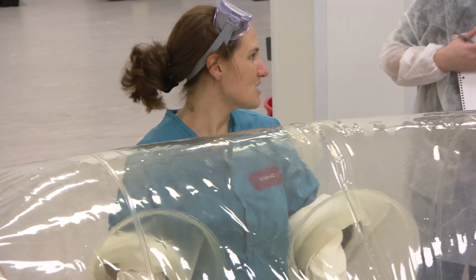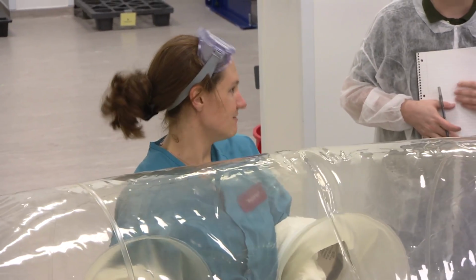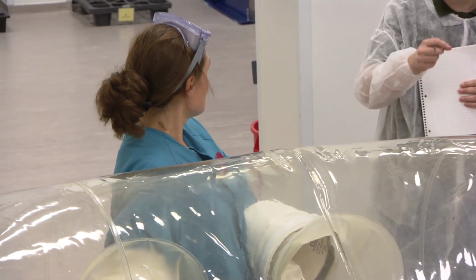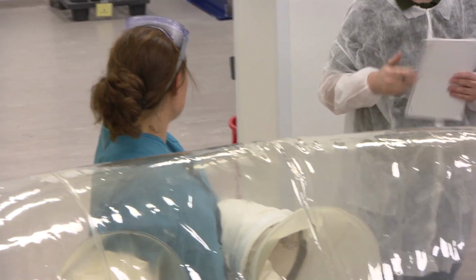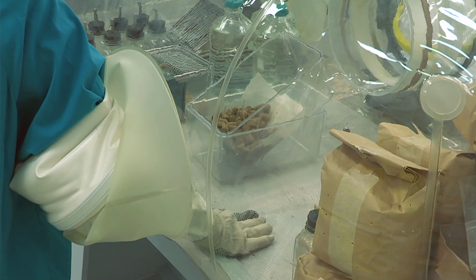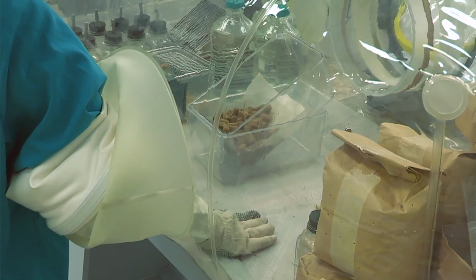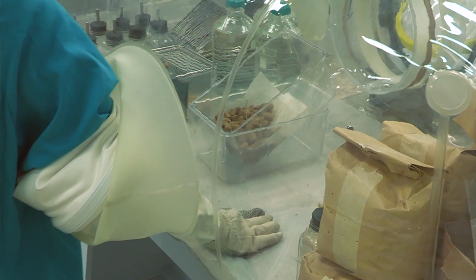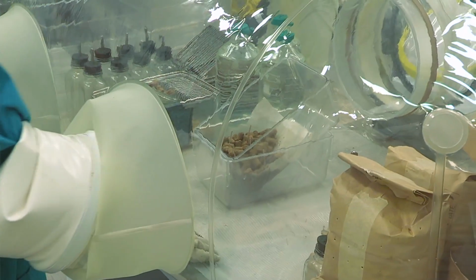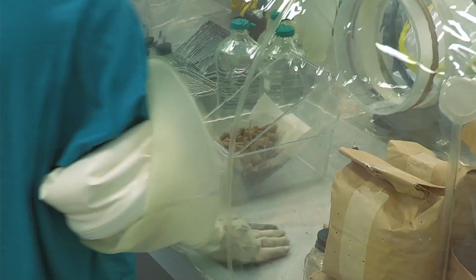And most times if there's something growing, you see it. It's visible. You said about take a little bit out. You mean a little bit of the food out, a little bit of the swab? Yeah, we'll take a little bit of the feed out, and we'll take the swabs from within here. We'll place the moistened feed right in the culture tube. But again, if there's something in here, you can see it. There'll be something green and fuzzy growing.